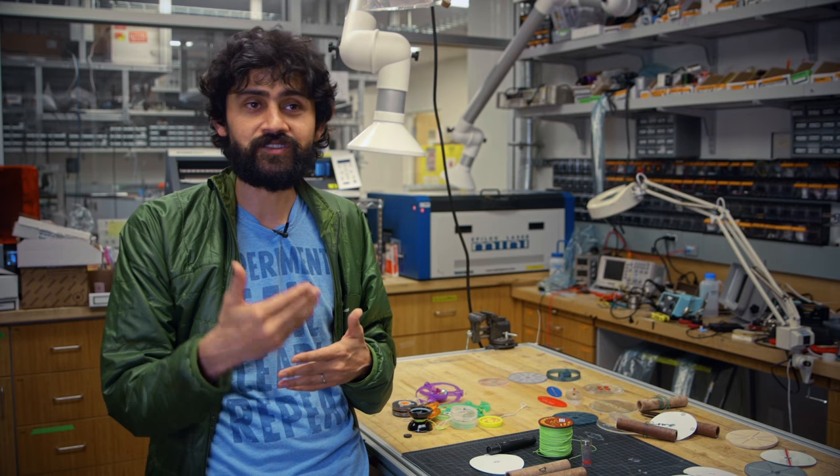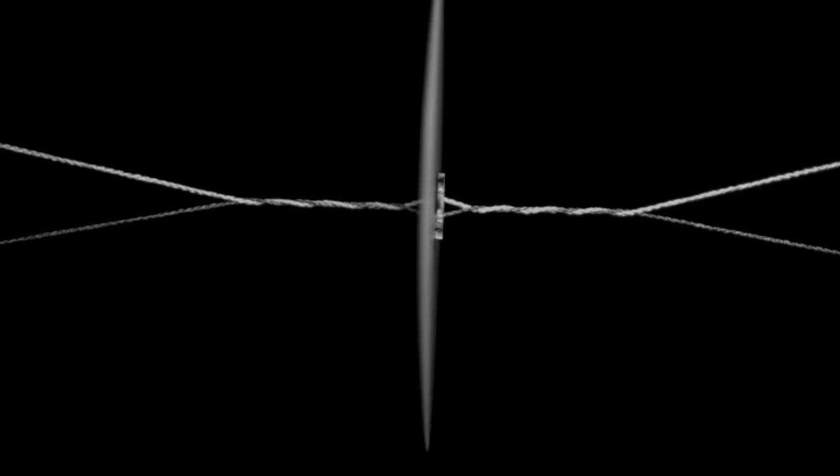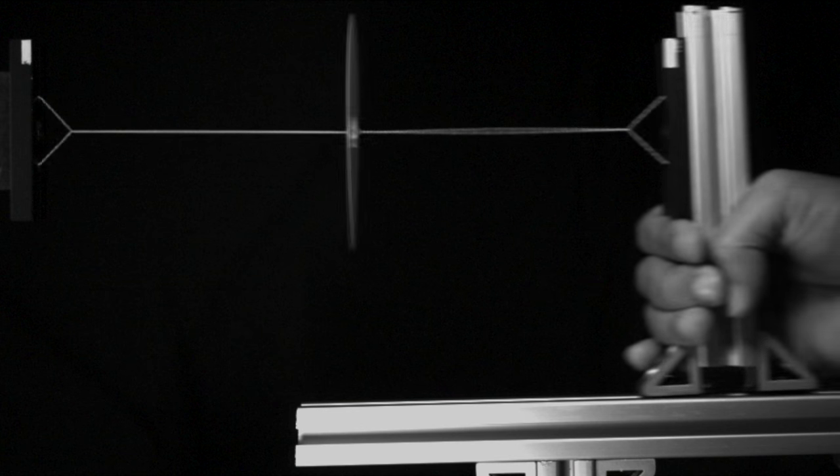Before us, nobody had actually understood how this toy works. So we spent a significant portion of time truly understanding the mathematical phase space for how you can convert linear motion into rotational motion. There's some beautiful mathematics hidden inside this object.